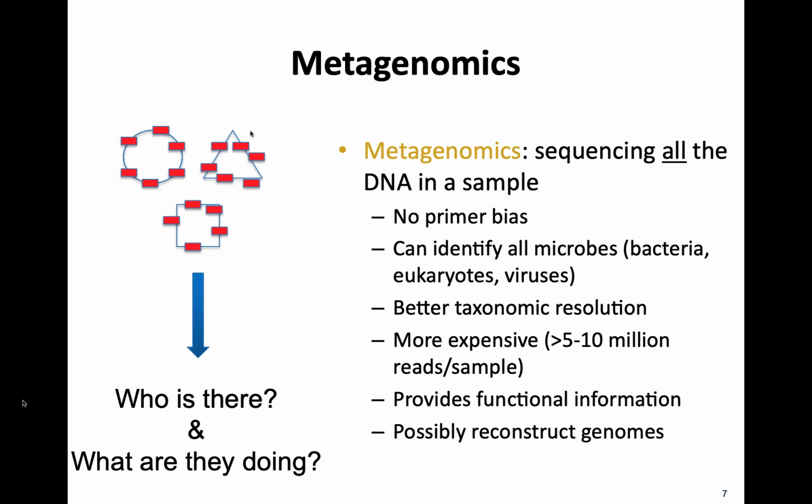So we did have a paper a few years back where we looked at biopsy samples in Crohn's patients. We wanted to look at the metagenome of Crohn's patients in a colonoscopy collected sample. With that one, it was around 100 to 150 million reads per sample, and we ended up tossing 98% of the data. Well, we didn't toss it actually. We took those other 98 million reads and did genotyping on the host. So it wasn't a waste. You just used it for your host genotyping. So you can factor that in too.